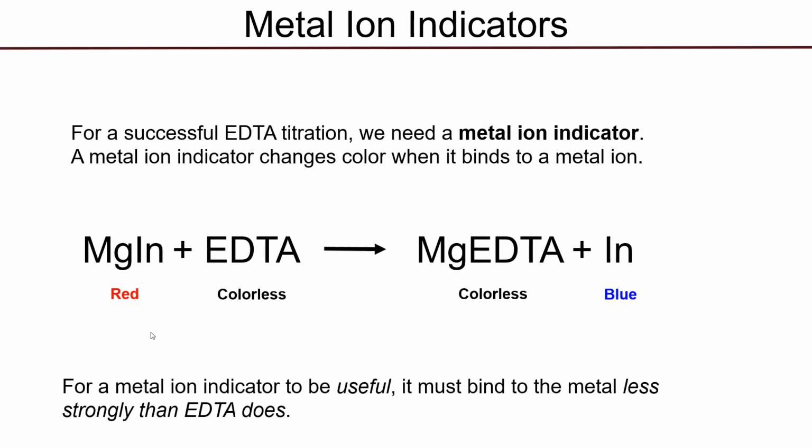So first, let's take a look at the one part of the EDTA titration that we haven't discussed in detail yet, and then we'll show you how you can combine all these different chemical aspects of the titration into a single experimental procedure for quantifying the metal ion.